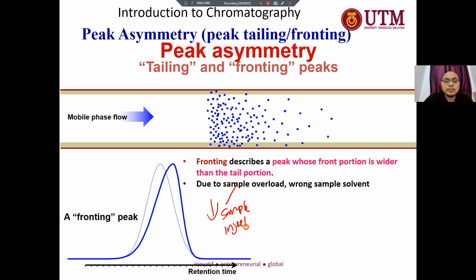It means that your analyte is too concentrated, so it cannot move as an optimum peak.